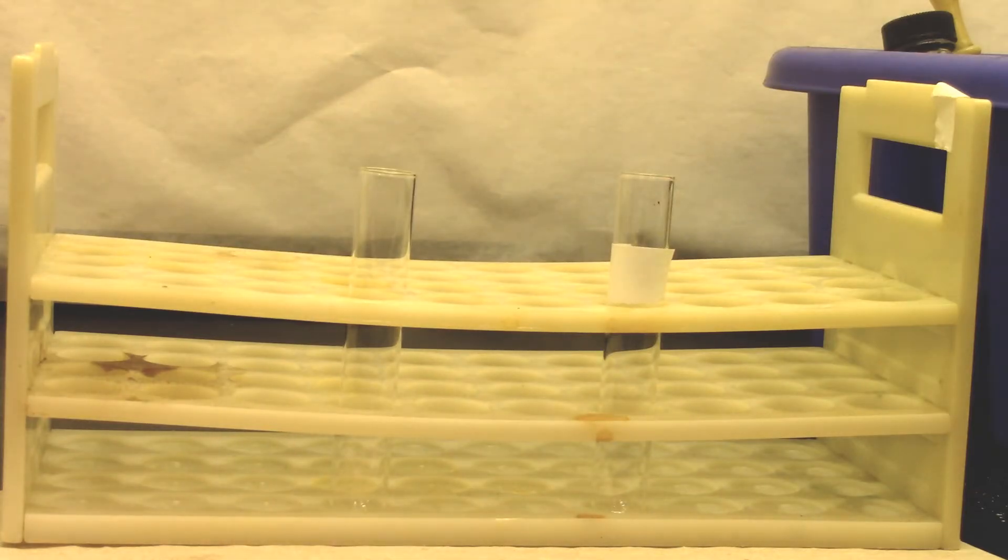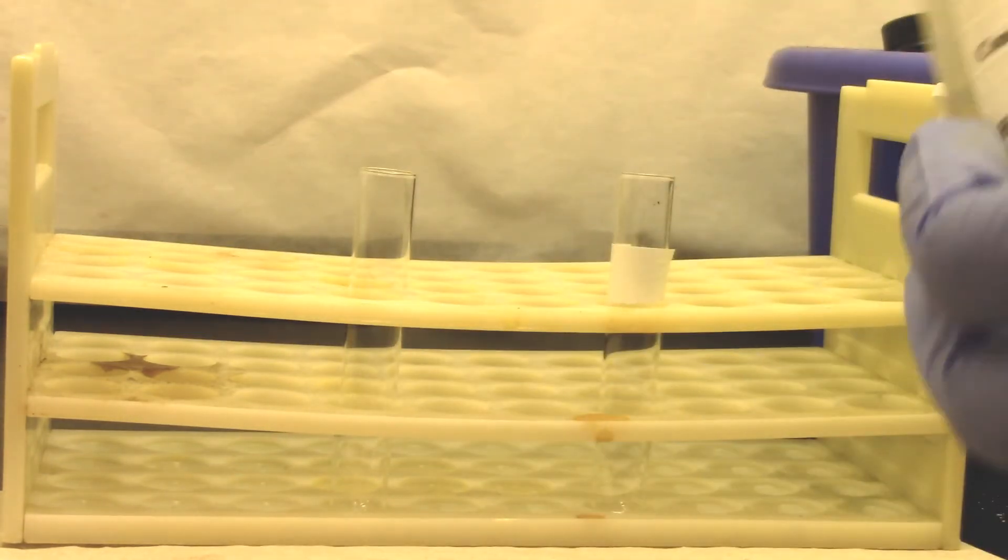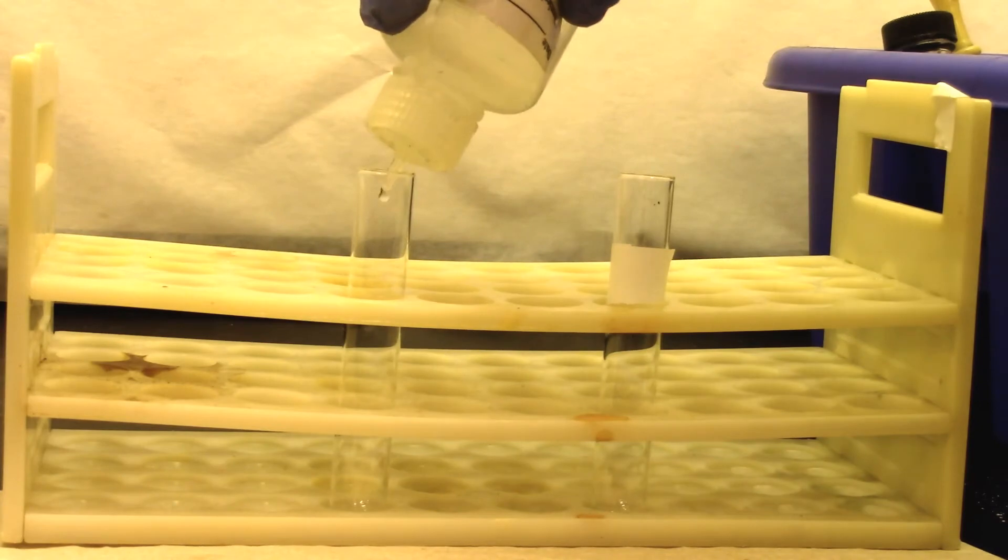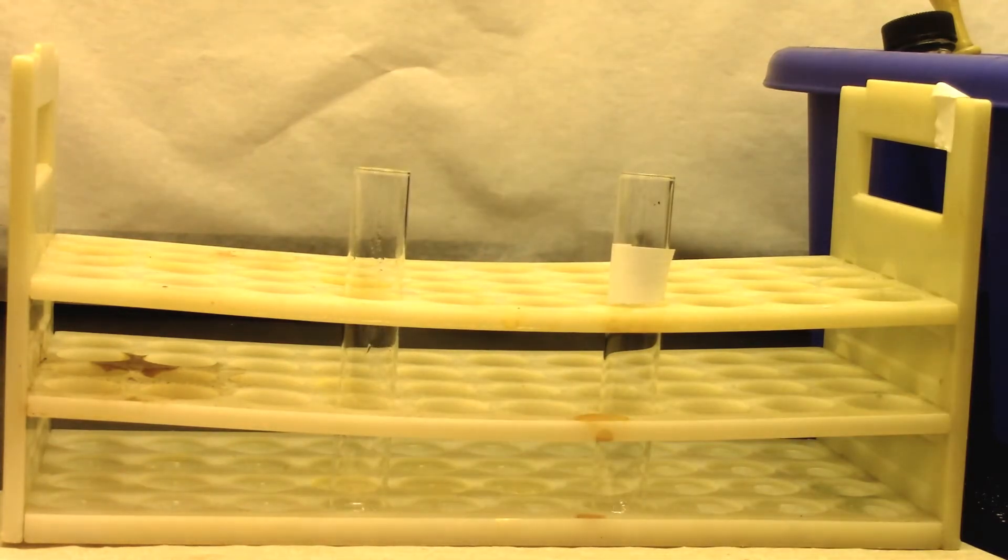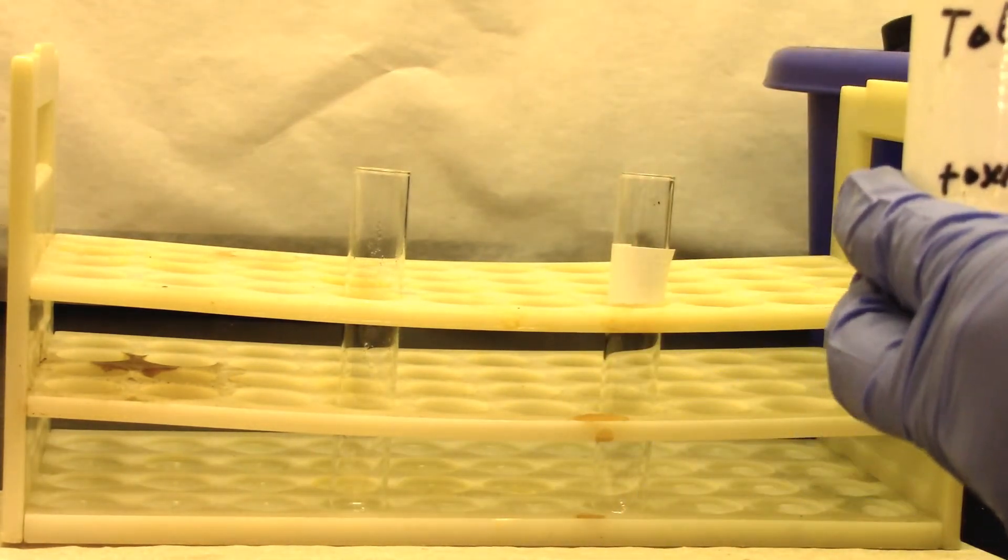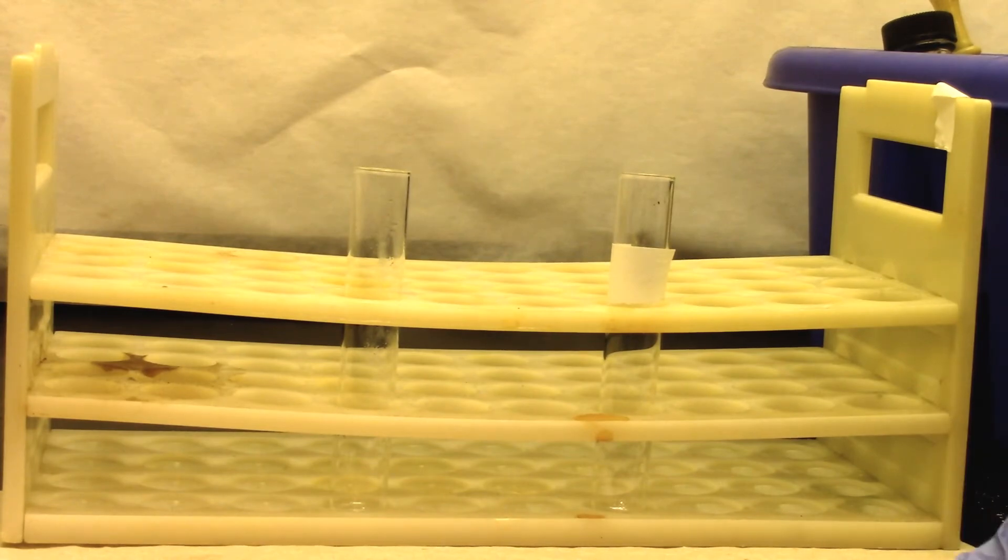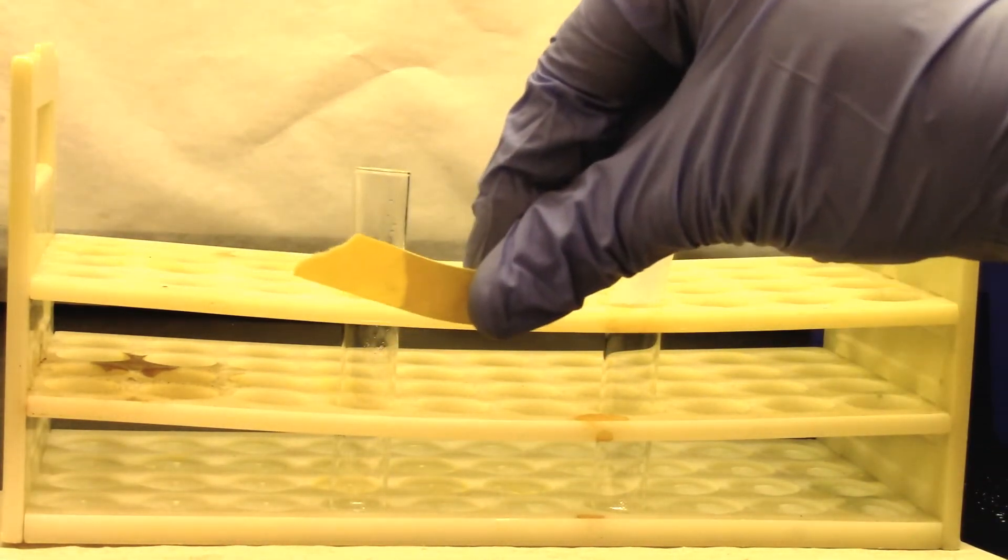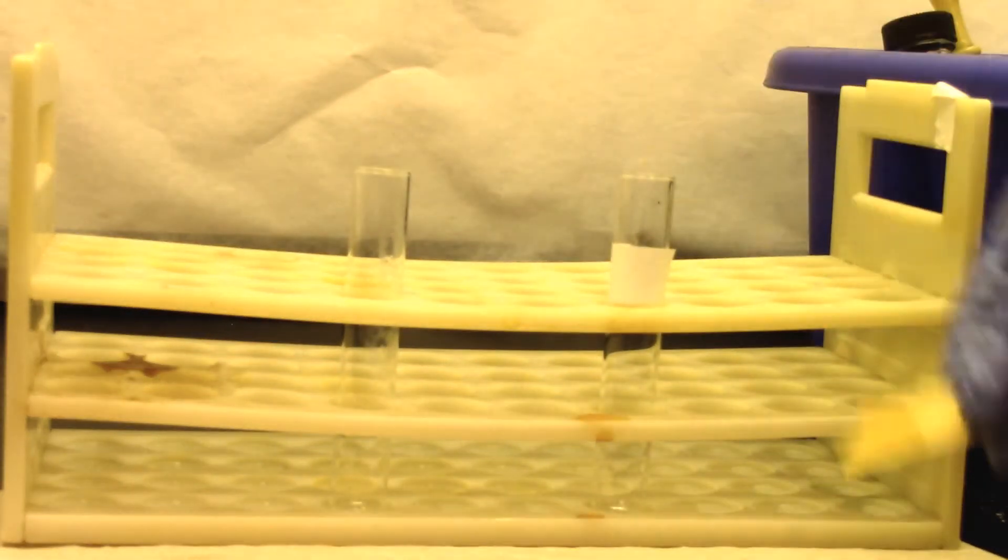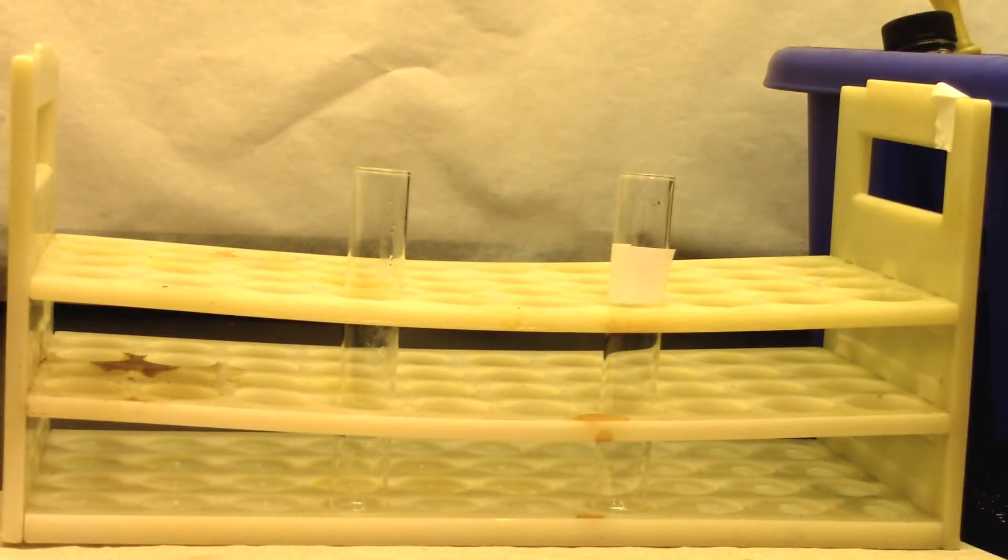We will be doing acetyl chloride test for alcohols. Methanol is my reagent, and then toluene is for my negative test. I have a moist litmus paper ready, and I am going to hold it on top while I add my acetyl chloride.